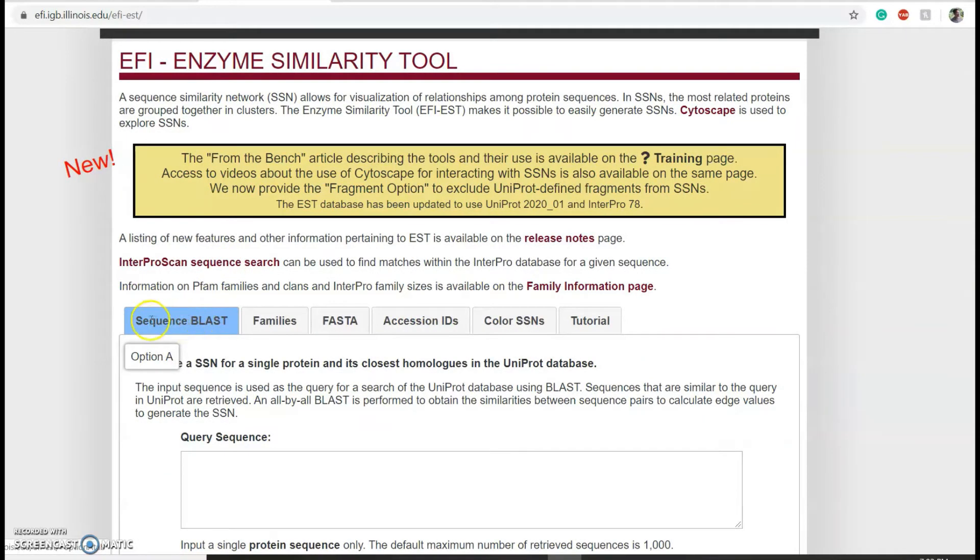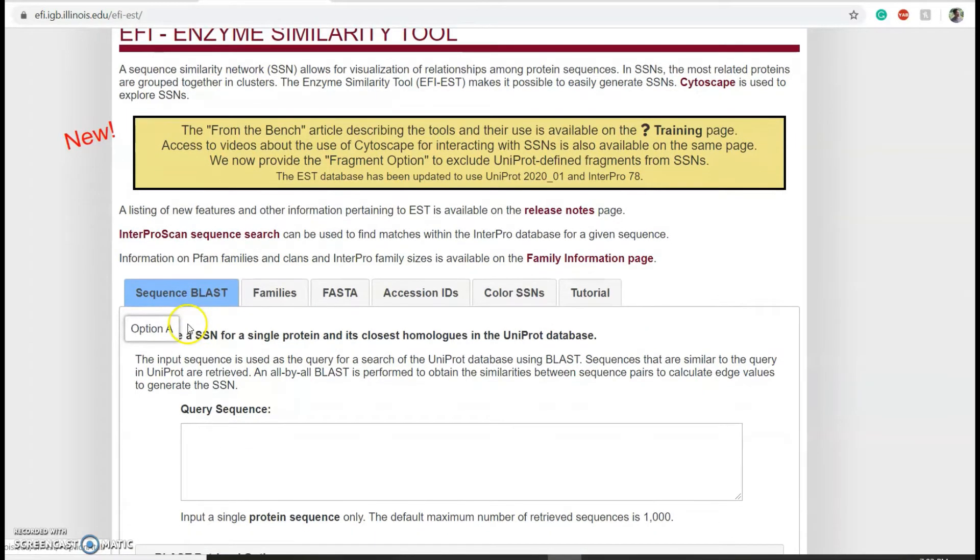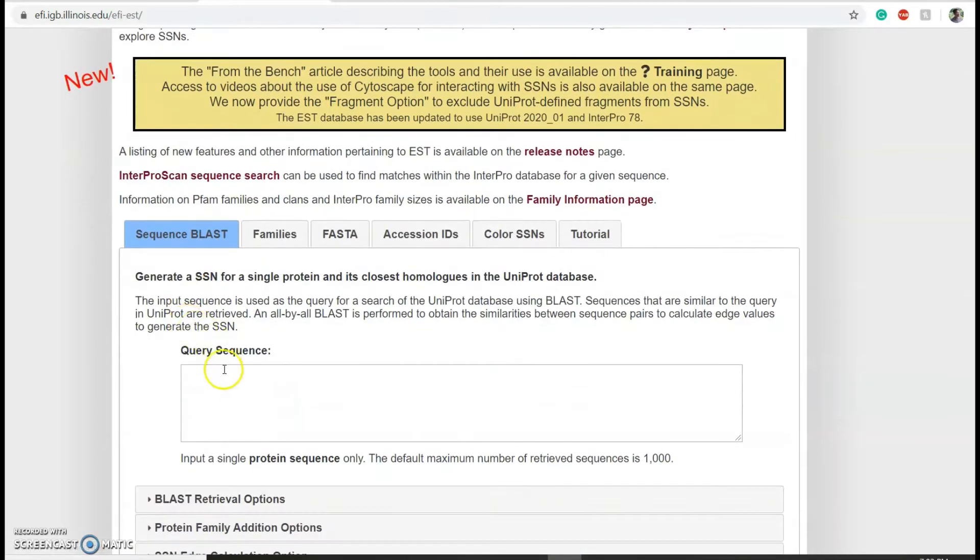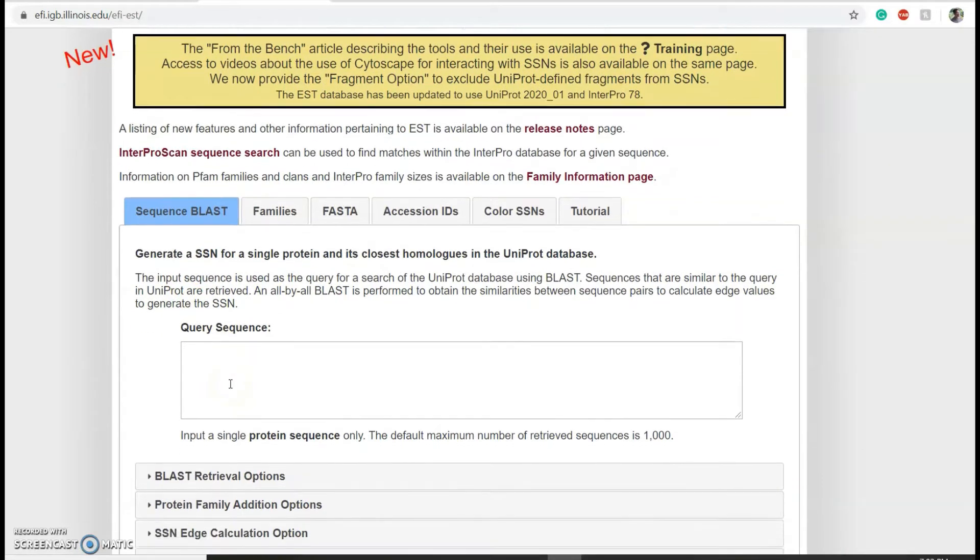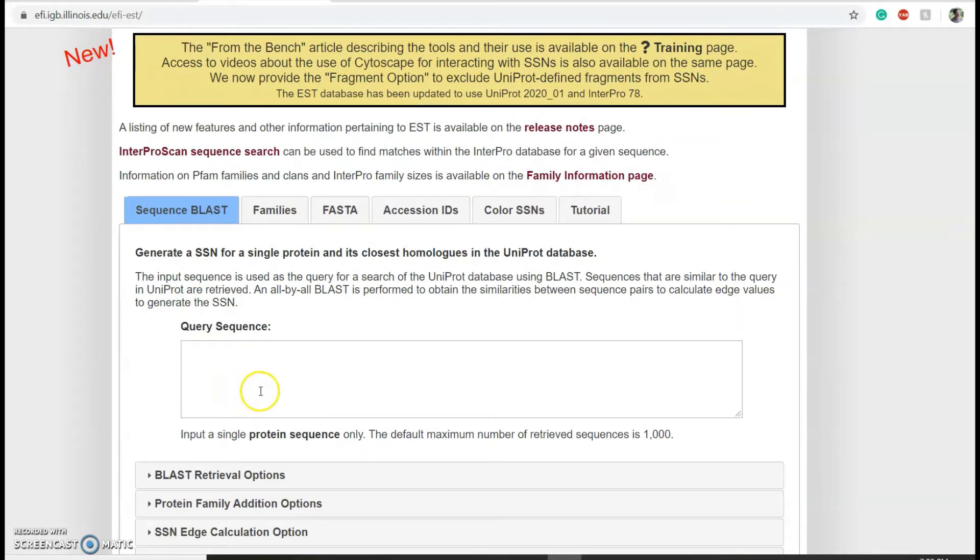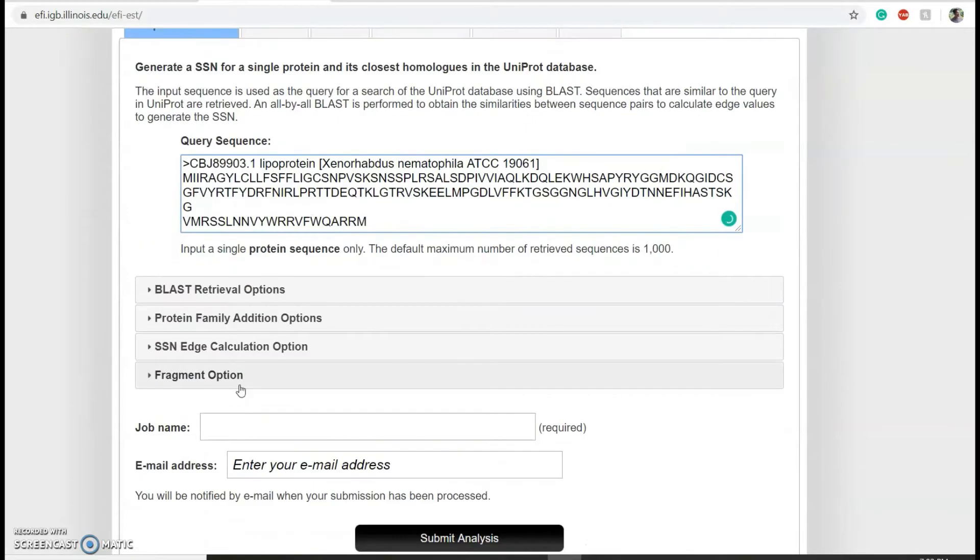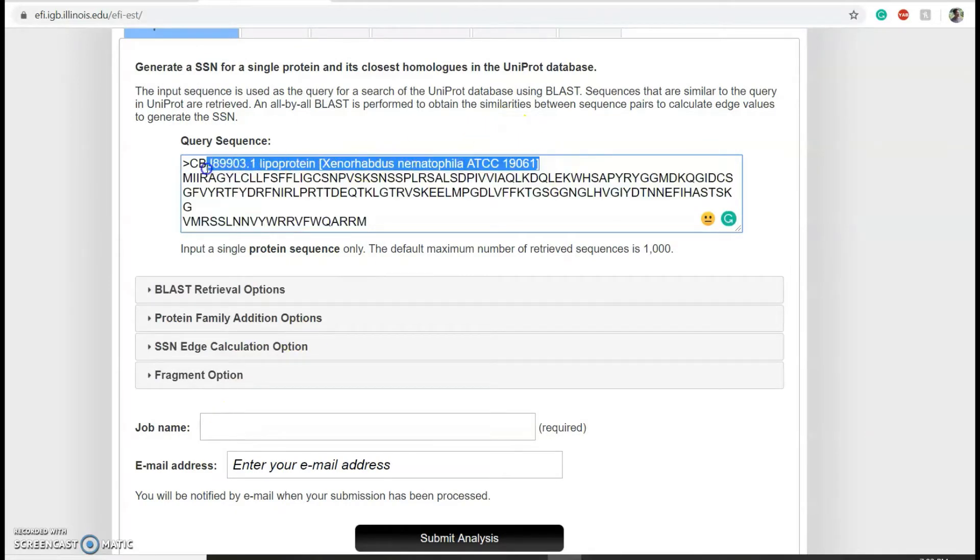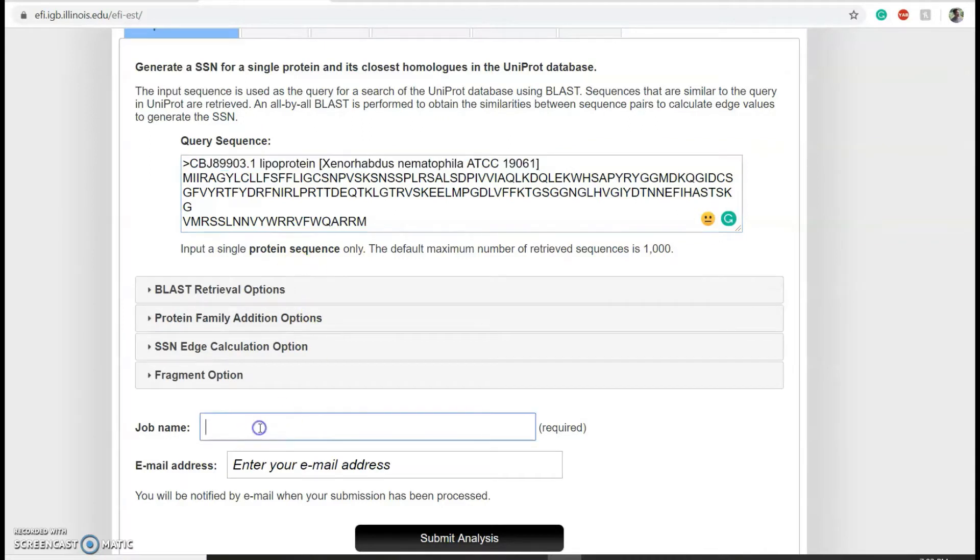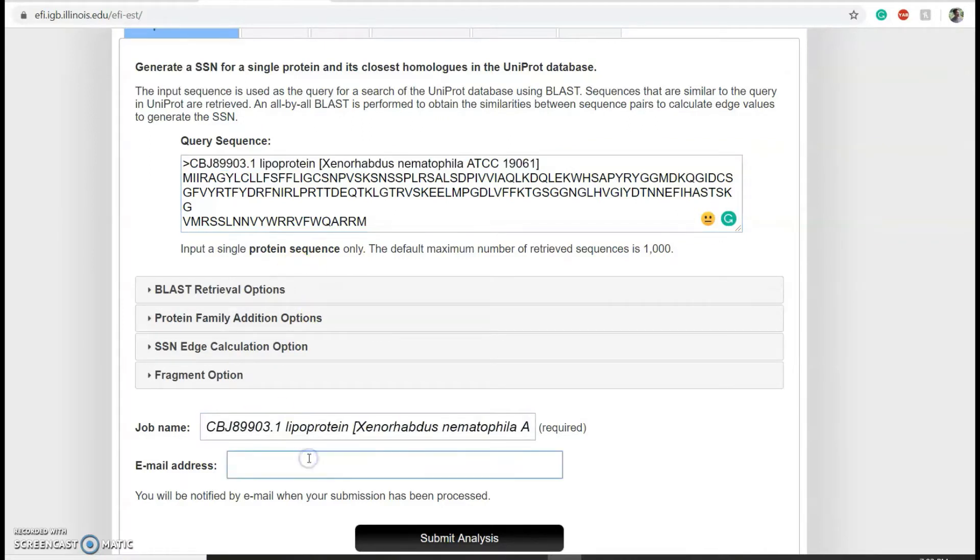Choose sequence blast, then add the fasta file for your protein of interest in the query sequence. You can add a job name - I'm just going to use this fasta header as my job name - and put your email address, then click submit analysis.